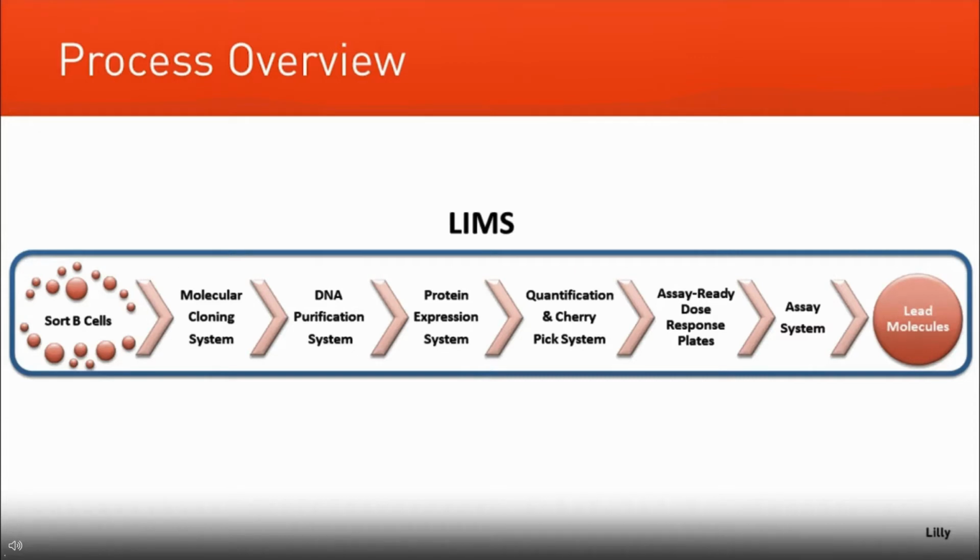And so really one of the overarching themes here is the software side of the process, where we're capturing a significant amount of data, whether it be purification amounts from DNA or purified material amounts from expressed antibodies, data associated with titers, and a significant amount of screening results toward the end of the process. And what we're trying to hand over is really a data package so our project teams can make informed decisions and triage down to lead molecules as fast as possible.